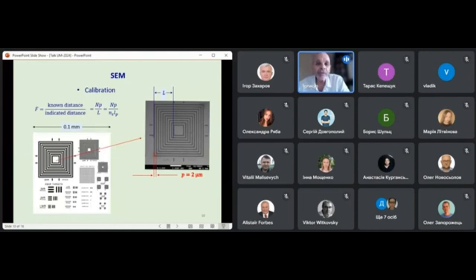But to find the pixel size, the user obtains the number NP of pixels in the scale bar, which is this white line down here, printed in the measurement standard. This number of pixels is used to divide the known length of the bar, which is 10 micrometers in this case, as printed down here below. Of course, it is wise to repeat the calibration measurements several times in the other 3 directions, the horizontal one and then the 2 vertical ones, and also perhaps repeat once more for more accurate results. What I just described is the standard calibration procedure.